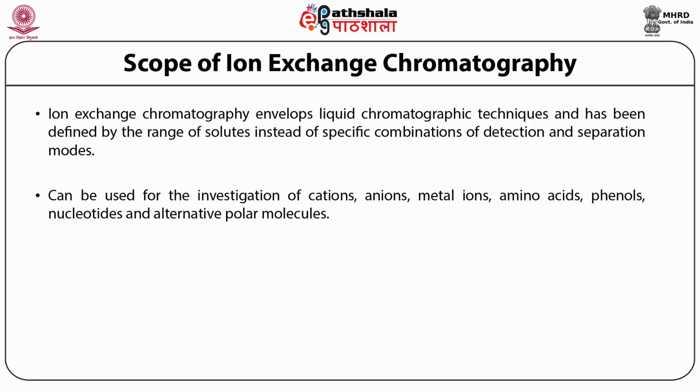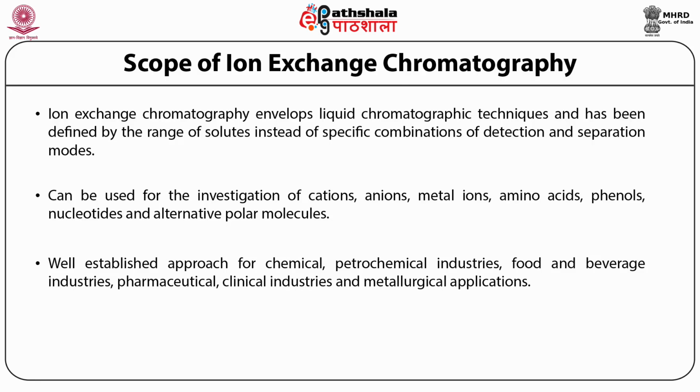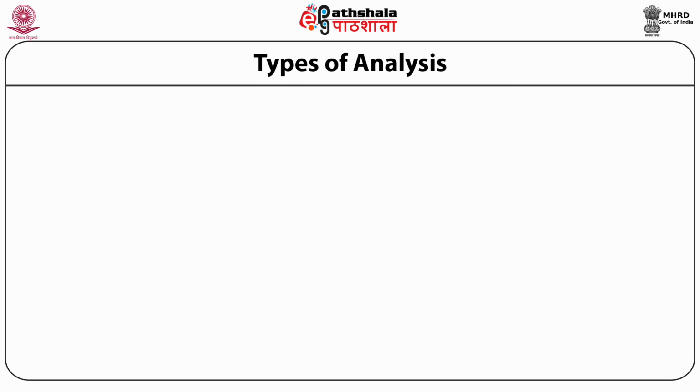IEC is considered a mature and well-established approach for chemical, petrochemical industries, food and beverage industries, pharmaceuticals, clinical industries, and metallurgical applications.